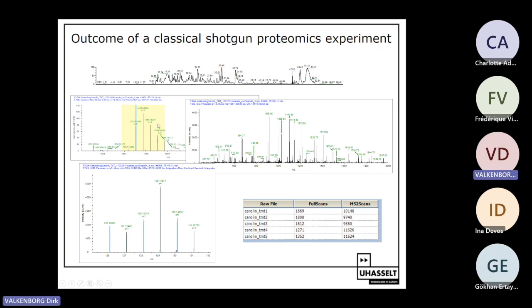A peptide is composed of amino acids, but other compounds can also display an isotope distribution, and based on the shape, we could perhaps decide that this is not a peptide but a contaminant, another organic form which we should not worry too much about. From this isotope distribution, you can also infer the charge state of the molecule, and when you have the charge state, you can pinpoint exactly the mass value. How you do this, I will not discuss in this lecture.